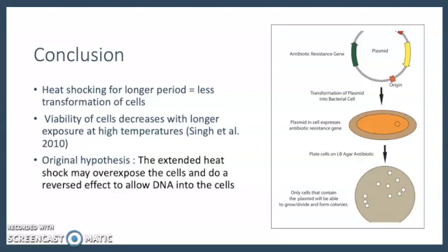We found in the Singh et al. paper, and the original hypothesis that was formulated, was expected. The overexposure to the heat shock could decrease the viability of the cells and reduce the transformation efficiency. So we agree with our hypothesis that we chose.